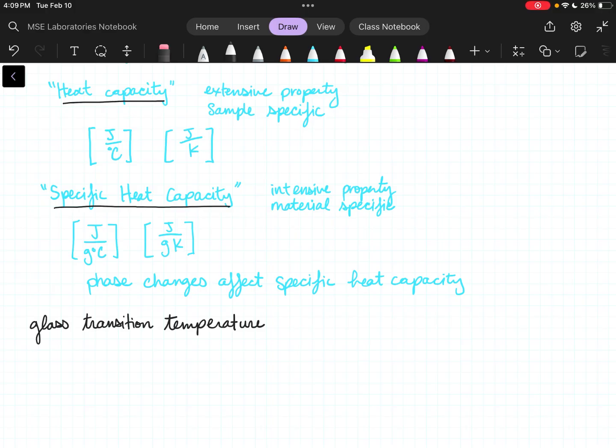Which is why it's not the same as freezing. Even though it appears like freezing, where we went from the softer state to the harder state, we were a solid all the way through that. We never went from solid to liquid. So it's not exactly a freezing, melting kind of interaction. It is definitely not an exotherm or an endotherm. We're going to talk about that in a little bit, but really it's just a molecular rearrangement.